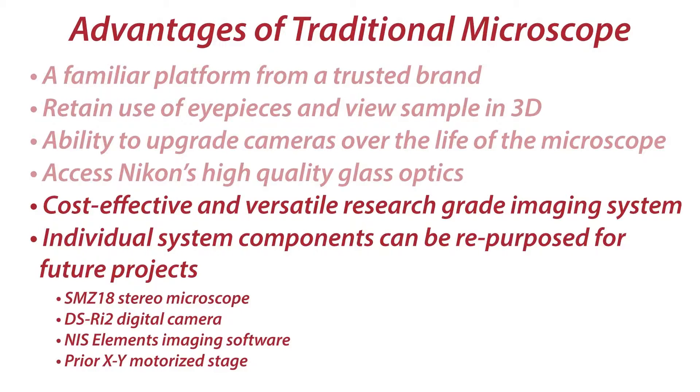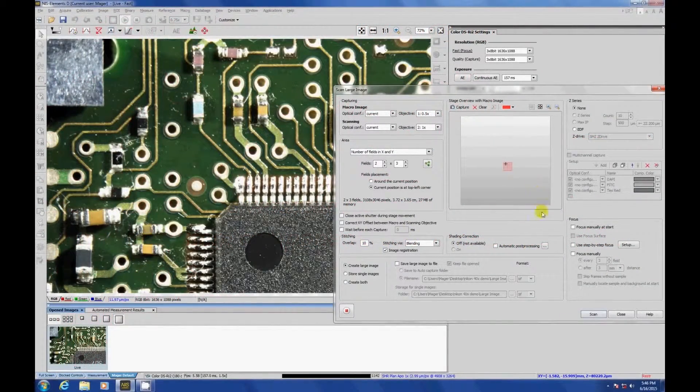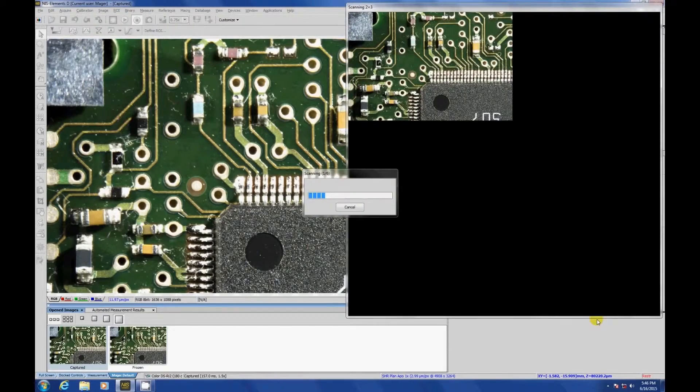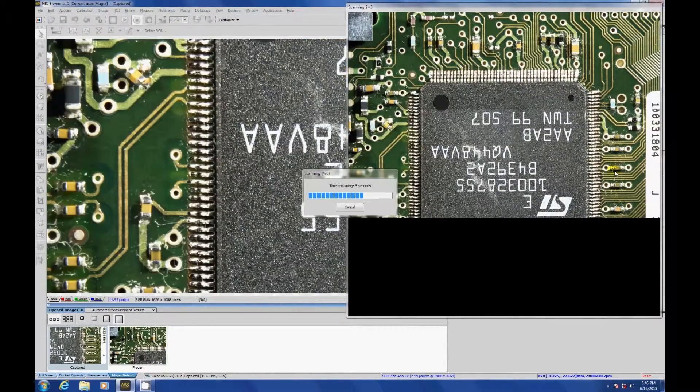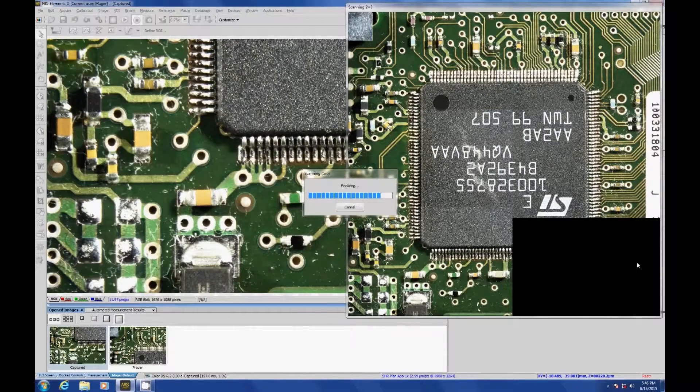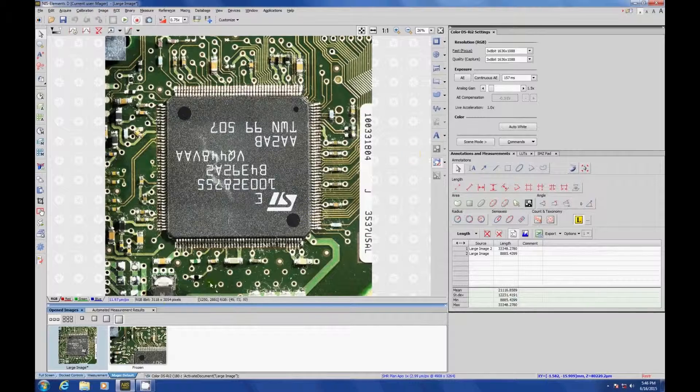So that's a brief overview of the research-grade SMZ-18 digital microscope system. We have a separate video that provides a comprehensive walk-through of the SMZ-18's options and features. Additional videos will show in-depth demonstrations of imaging techniques, such as capturing all-in-focus images and image stitching.